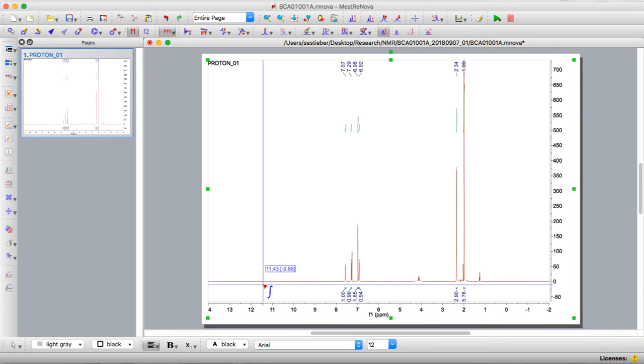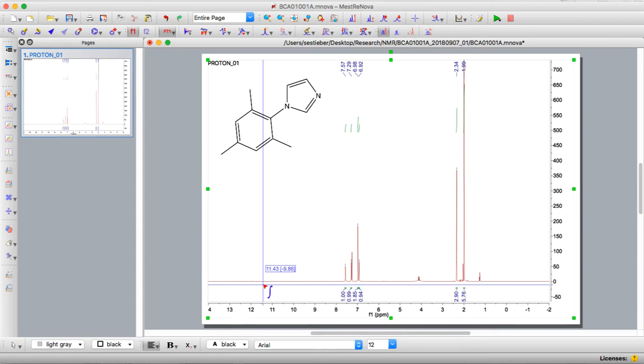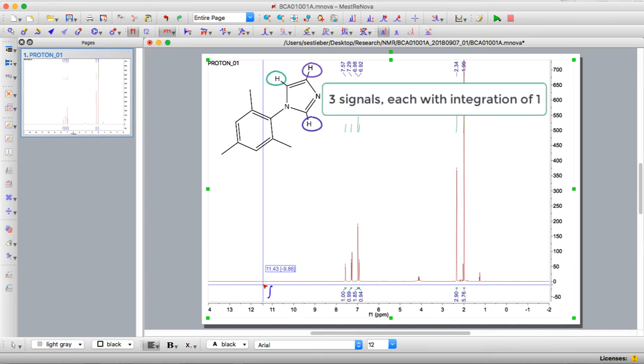I know that this is supposed to be mesityl-imidazole, so typically you should have an idea of what you expect. In mesityl-imidazole, if we just look at the structure, we can determine how many distinct protons we expect to see. If we look at the NHC part there are three total protons. They're all unique and so we expect to see three signals that each have an integration of one.